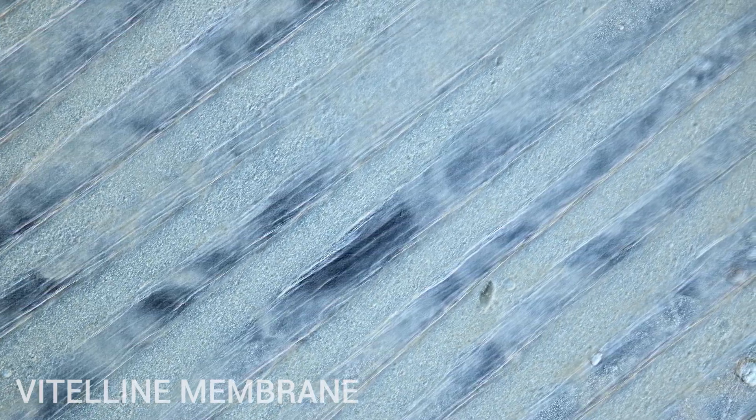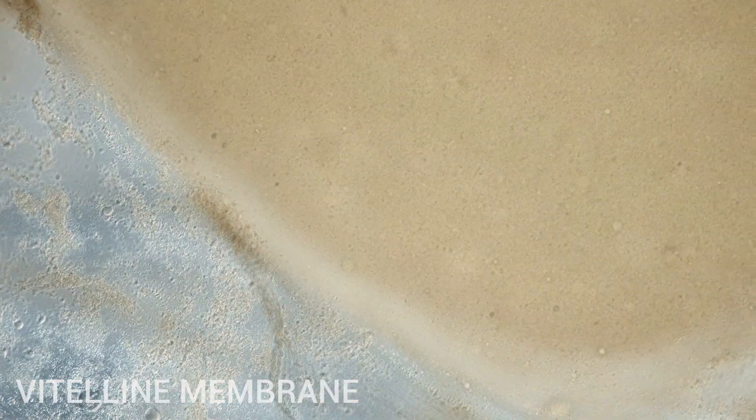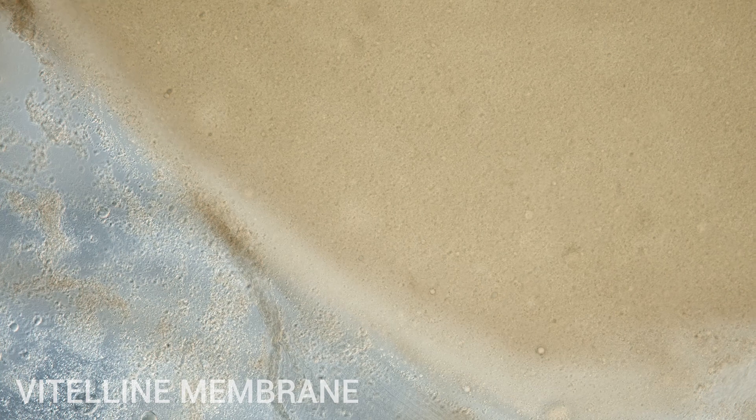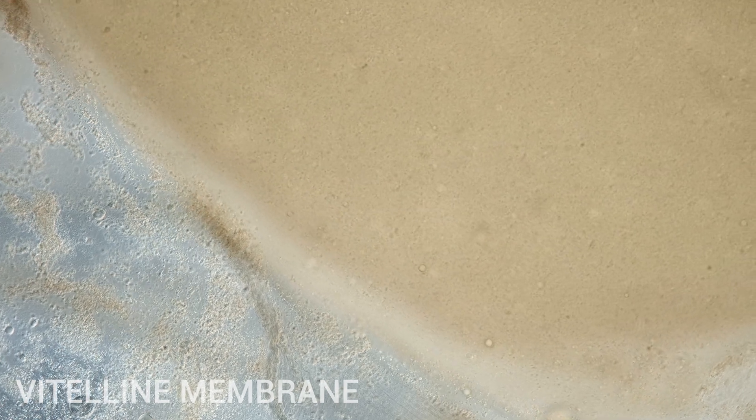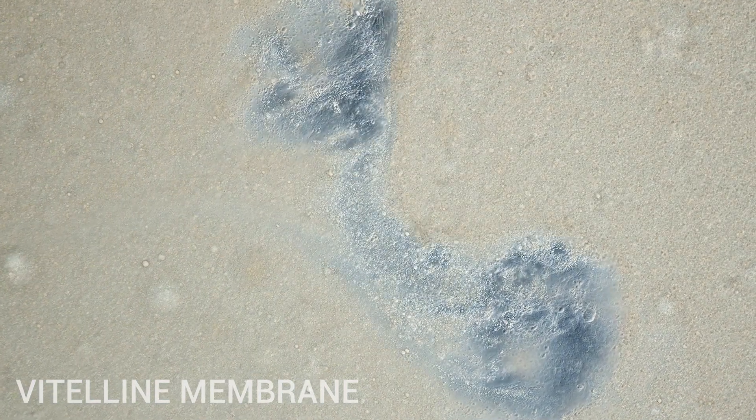Lastly, we have the vitelline membrane. The vitelline membrane is the extracellular protein membrane covering the entire yolk — or, putting it simply, a bag that holds the yolk's content. The vitelline membrane protects the yolk from breaking and spilling inside the shell. The mechanical properties of this membrane can be considered as a measure of egg freshness. If the membrane is weak and deteriorating, then you are probably eating an older egg.